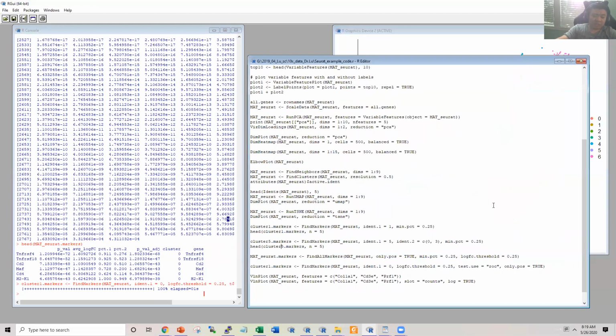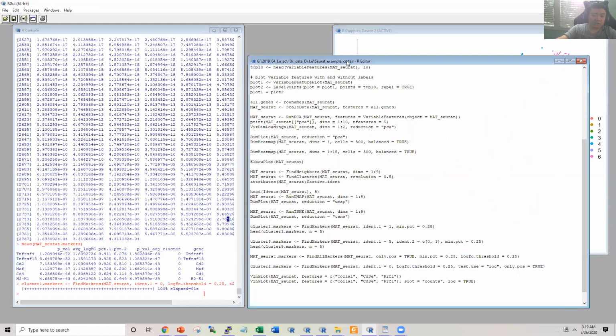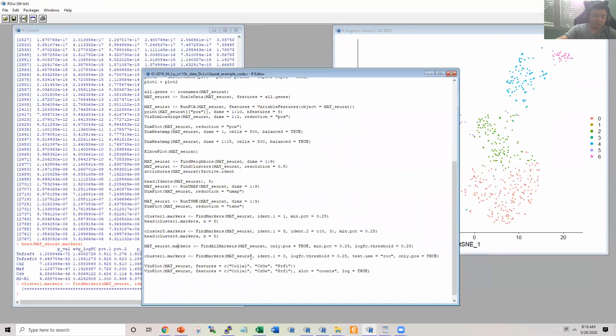But for all these types of analysis, it may need certain efforts to first check the expression variation of the marker genes and also the rationality of the selected marker genes. So you can implement those ideas into Seurat's approach, but the general approach of Seurat is relatively coarse. It's just for general data visualization and general data characterization. So here I may show the differential gene expression analysis used in Seurat.